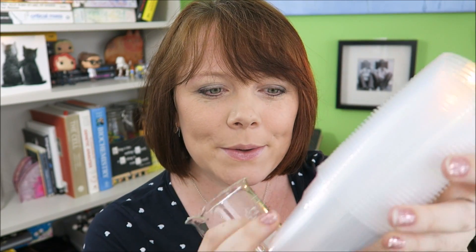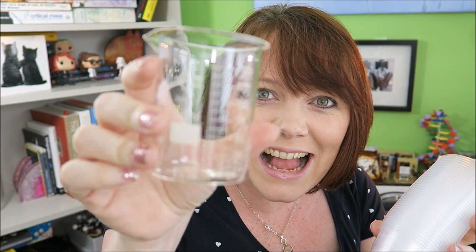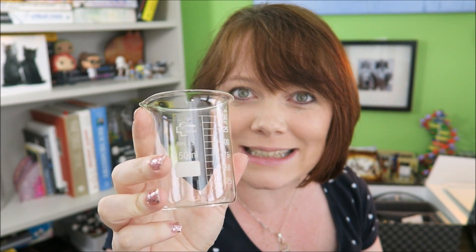Onto the bigger box now. Loads of little plastic cups for measuring stuff out. And look — actual beakers. Now I know I have loads of beakers at school, but I don't have any at home. And now I have actual beakers at home. This is really cool. I'm really excited about having my own actual beakers, because I'm a science geek. You just have to forgive me that I'm excited about having actual beakers.